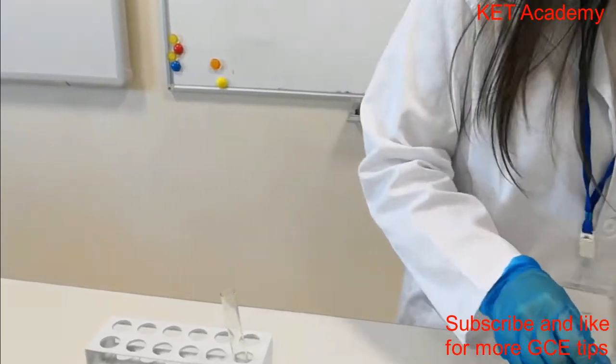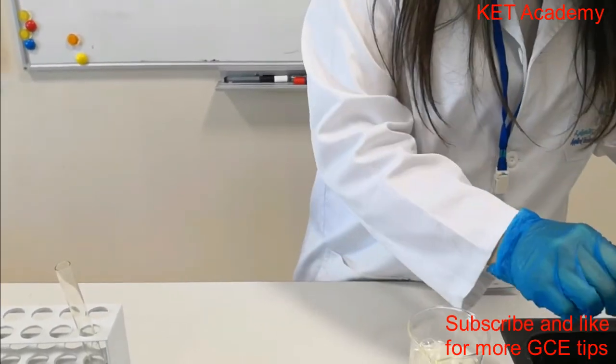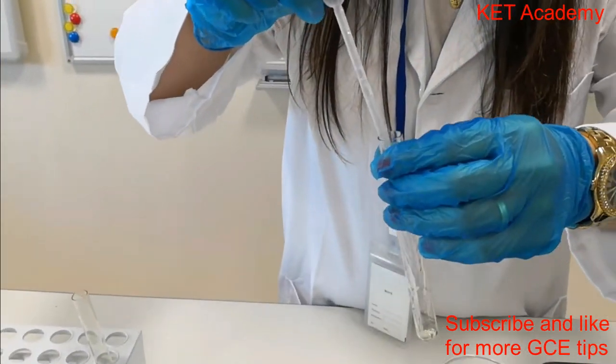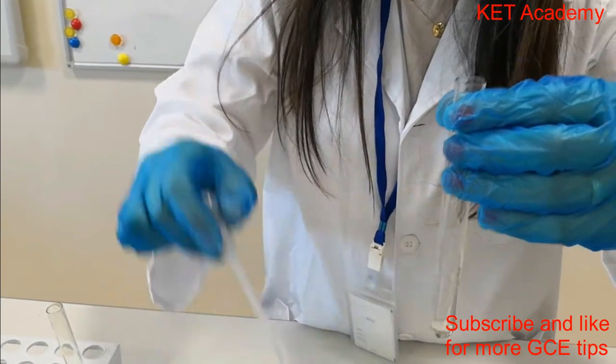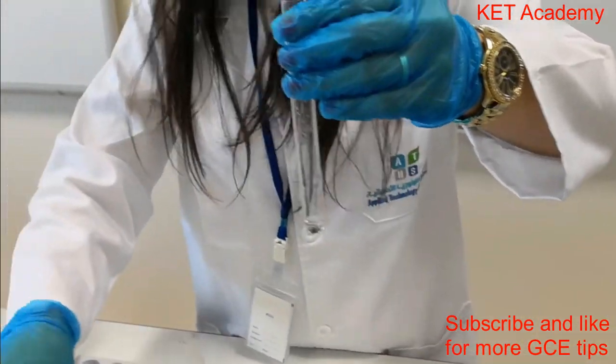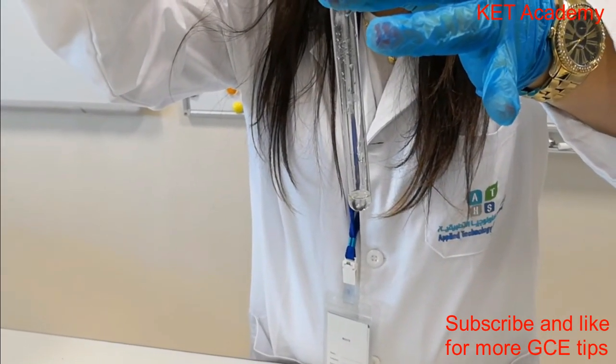Okay. Now, let's try with the potassium. This is a sample containing potassium ions. We add to it drops of sodium hydroxide.